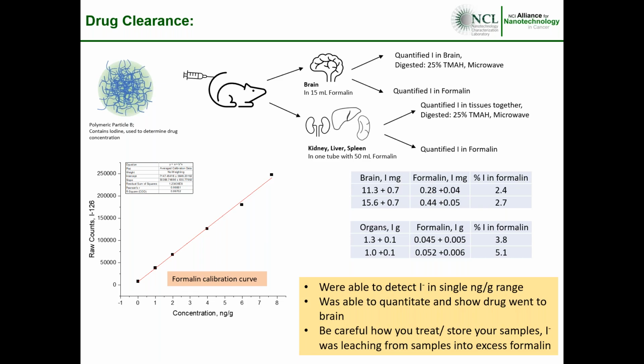And as well as the brains, we see quite a bit of it just accumulating in the organs. And we don't have any time studies for this. We don't know how fast they're cleared or what. These are just single point collections.